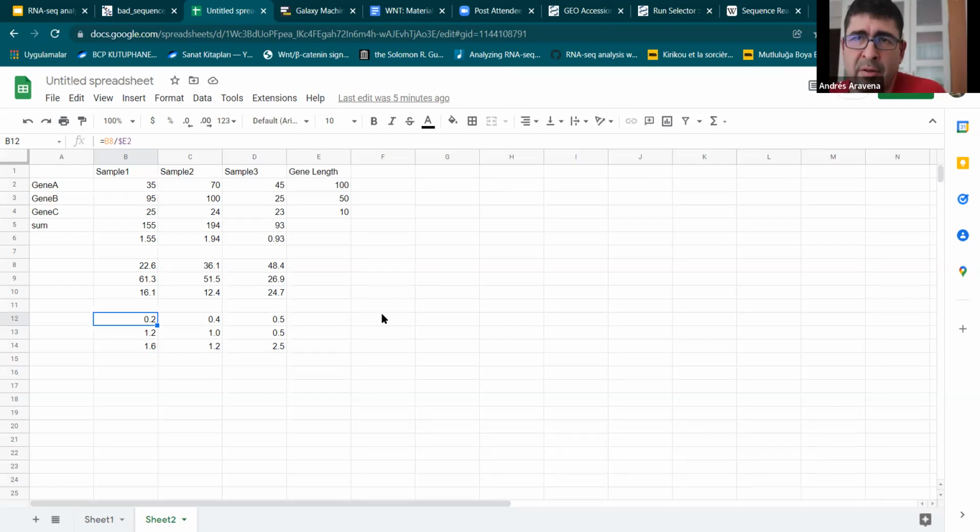But there is another approach in which you divide by the gene length first, and then you take the sum, because the part that is not commutative is the first step when you do the sum. I don't remember right now. I prefer not to invent, but there is some strategy in which you divide first and then you do the sum. Those are things that I have to understand before next class.